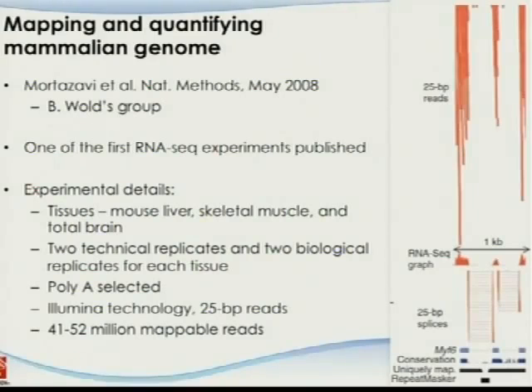At that stage, this is the state of the art. So a lot of things that I'm talking about in this paper, you may think are so straightforward, or sometimes even laughable, but that was 3 years ago, and the technology was 25 base pair. Now we are pushing 125 base pair for some of the platforms, and for 454 it's even 400 base pair. So technology development really improved a lot.